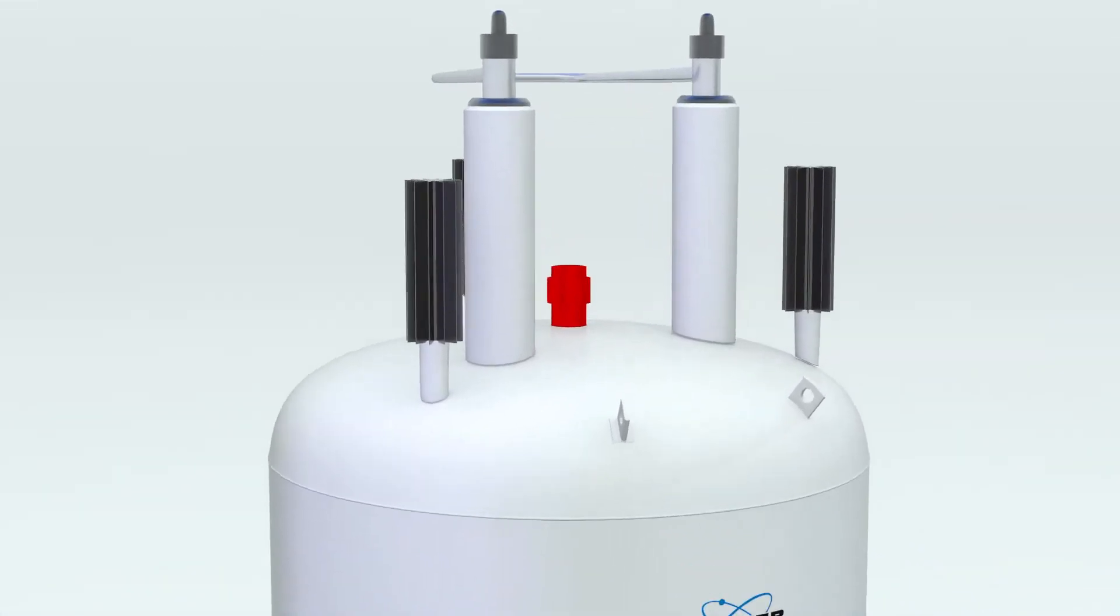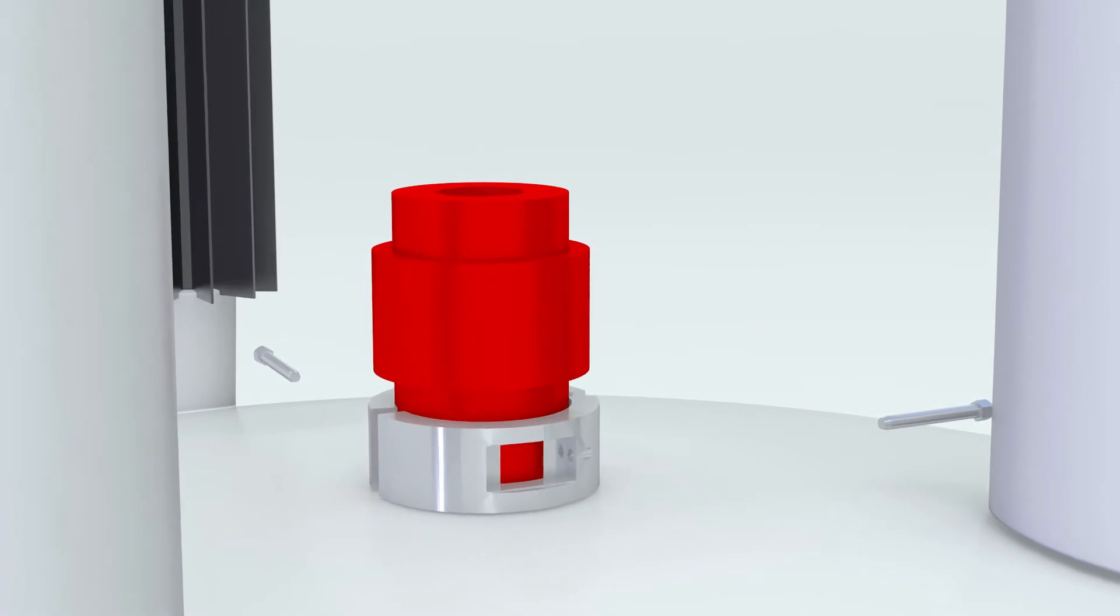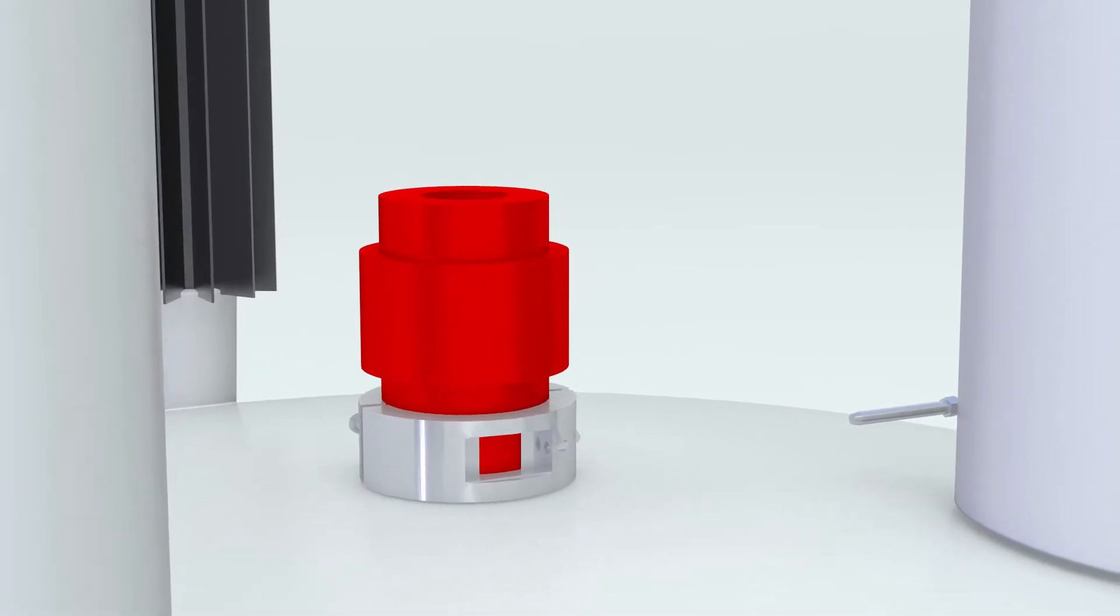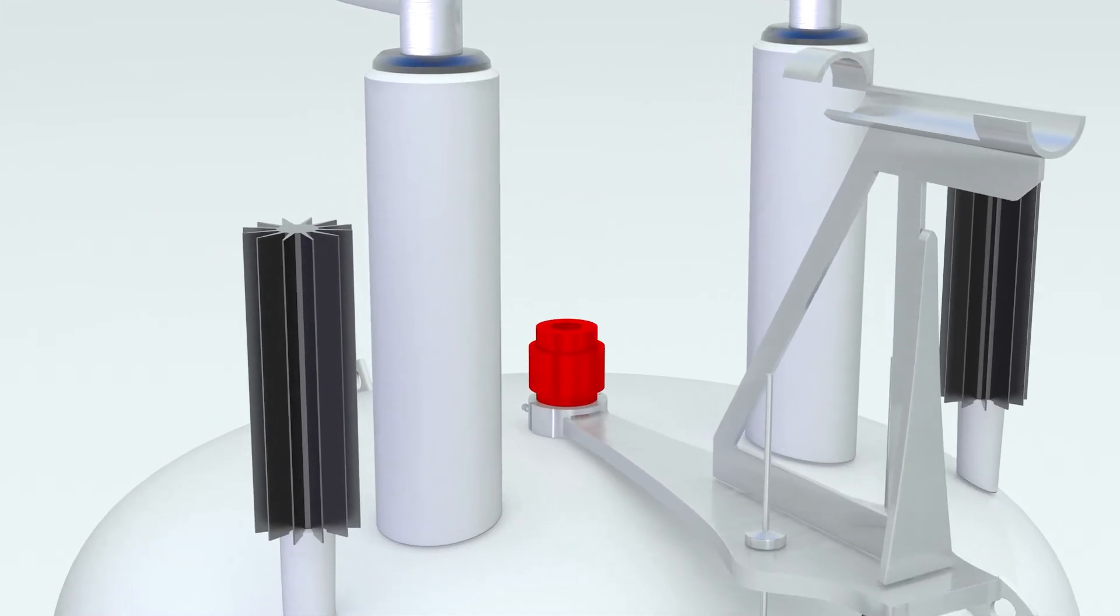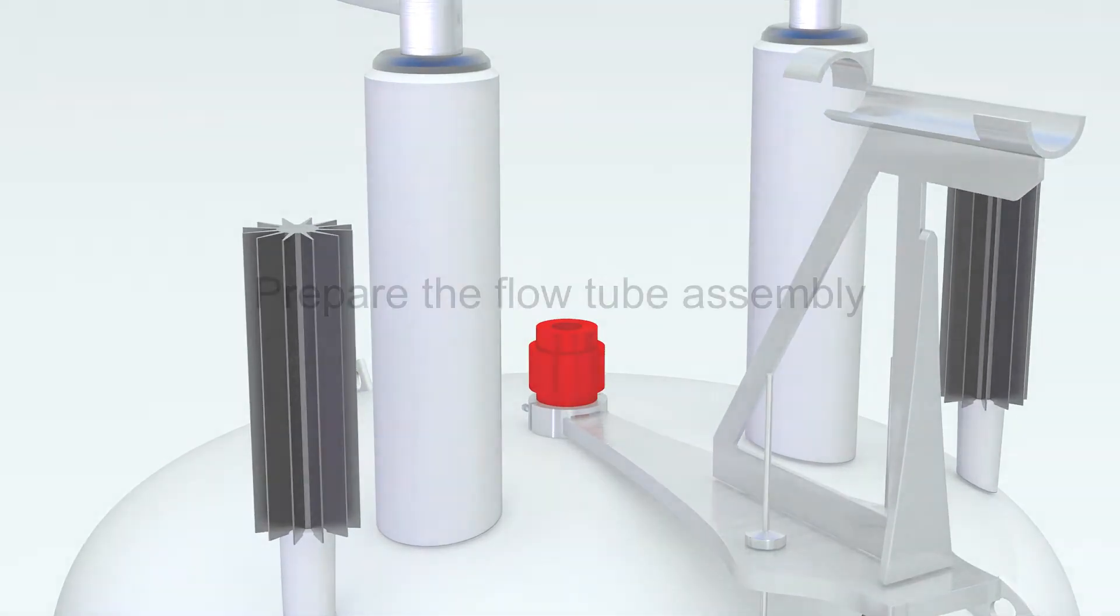Attach the transfer line holder to the Bruker sample transport, shown here on the red collar. Note that the transfer line holder cannot be used when the sample jet sample changer is installed.